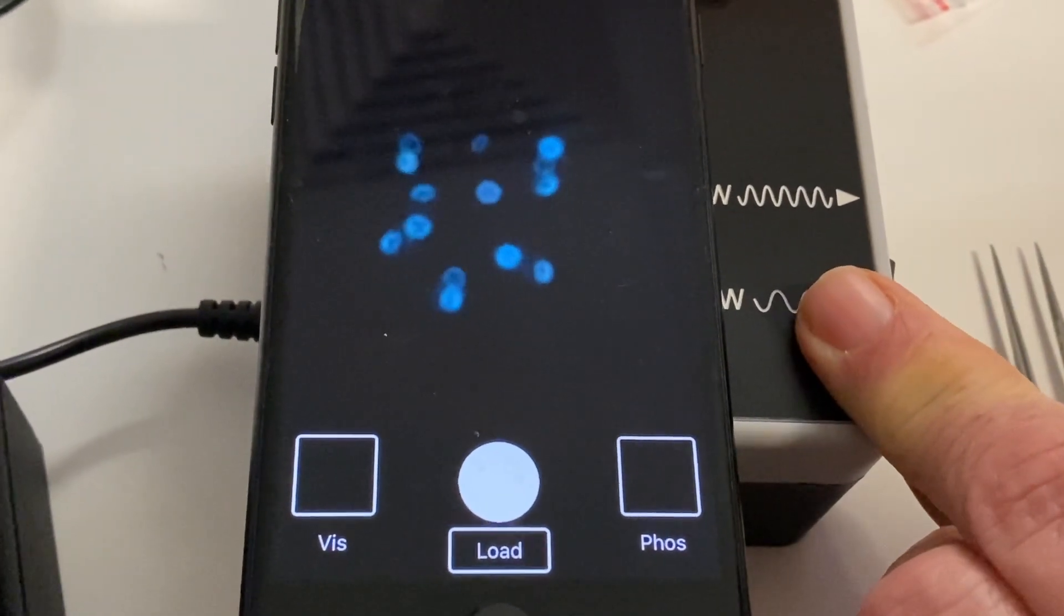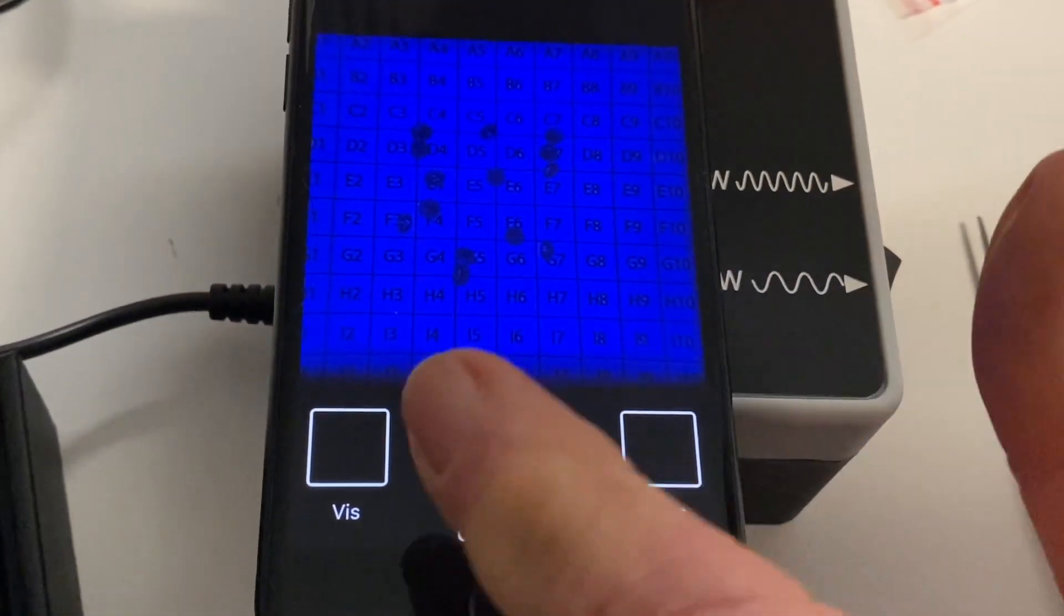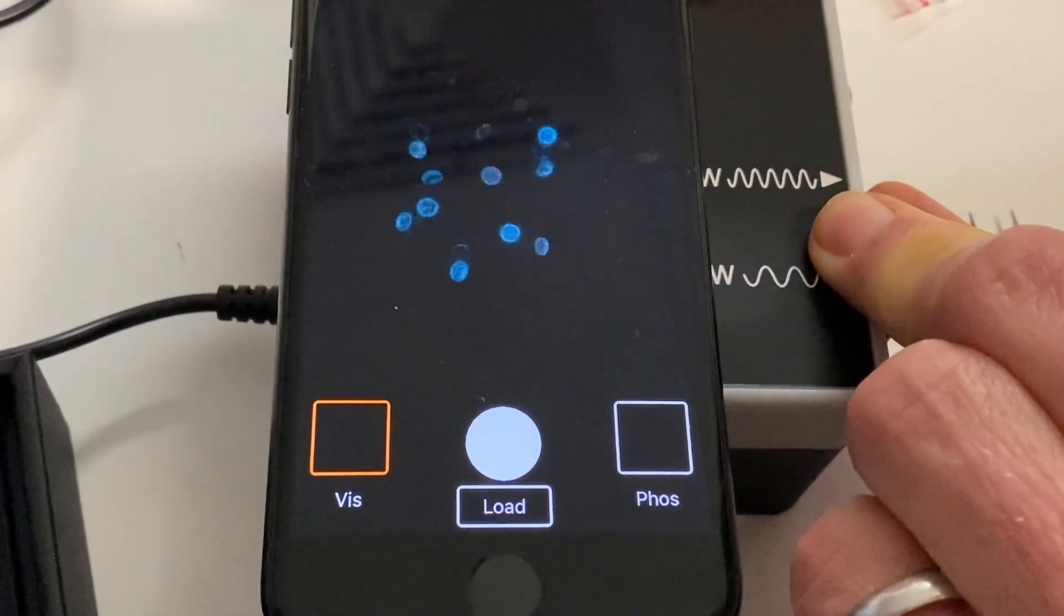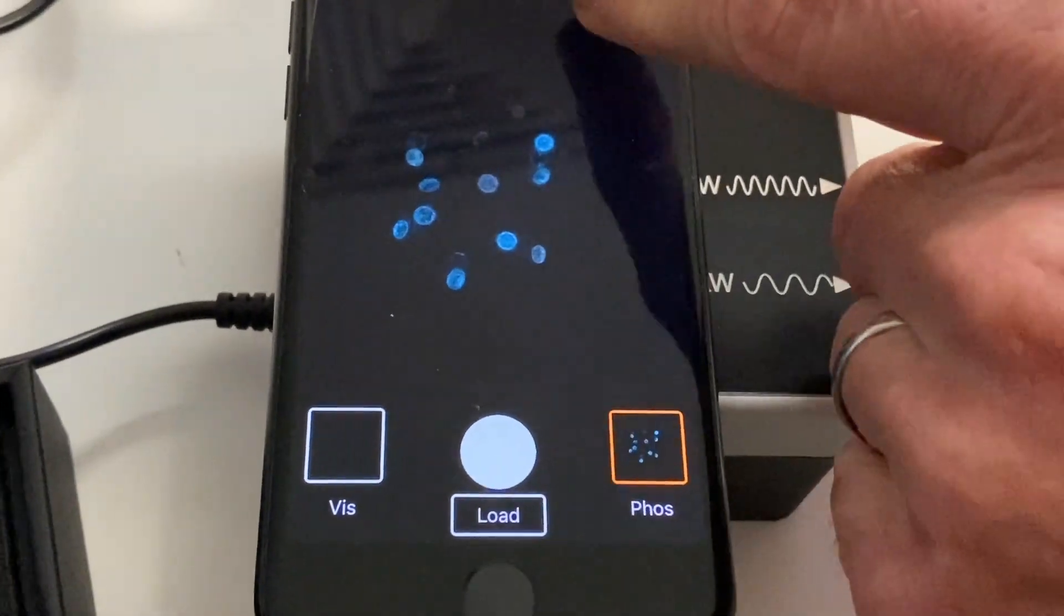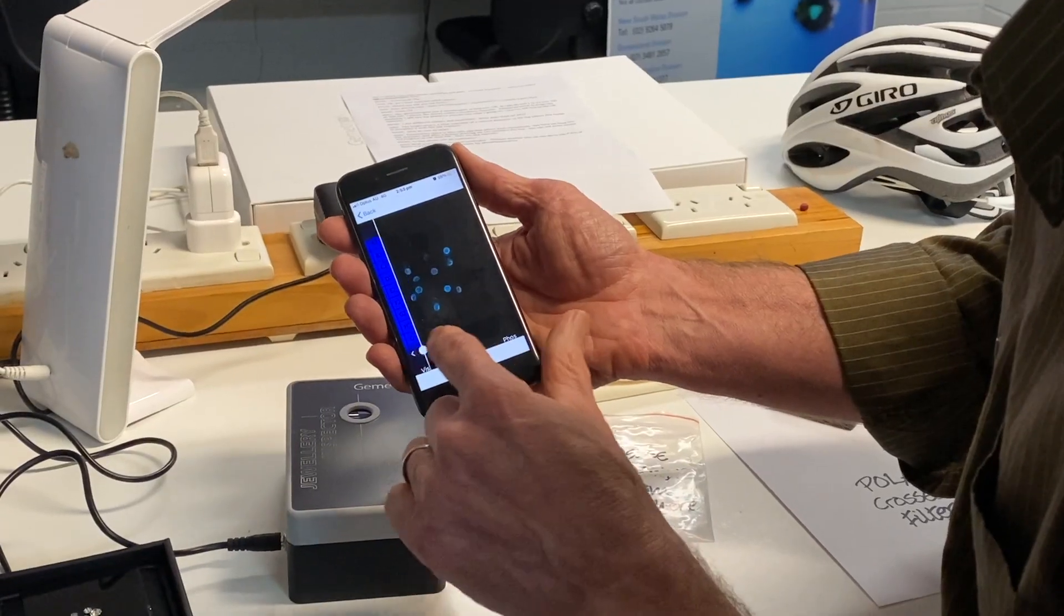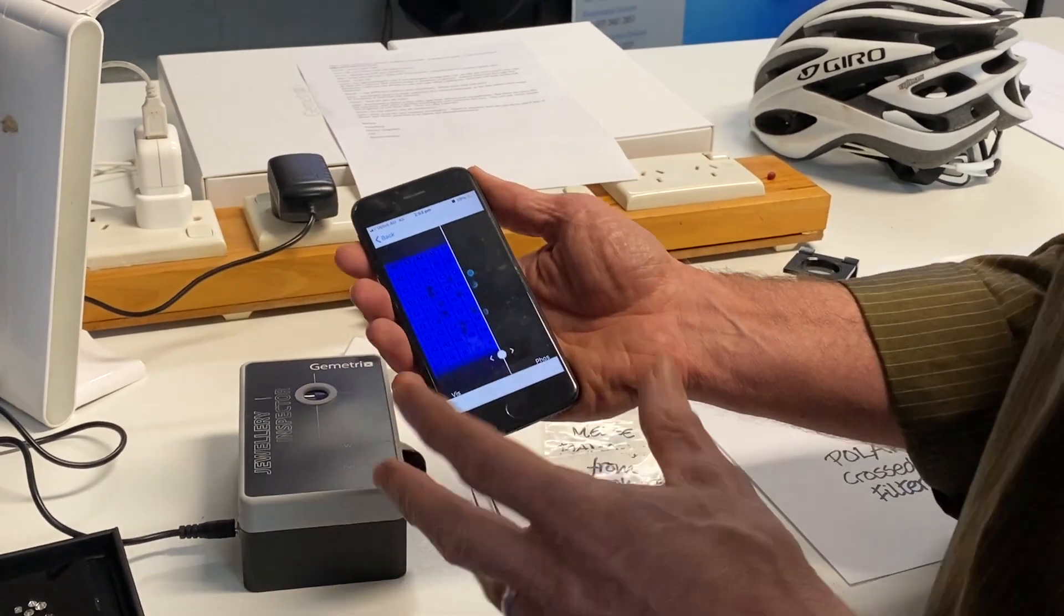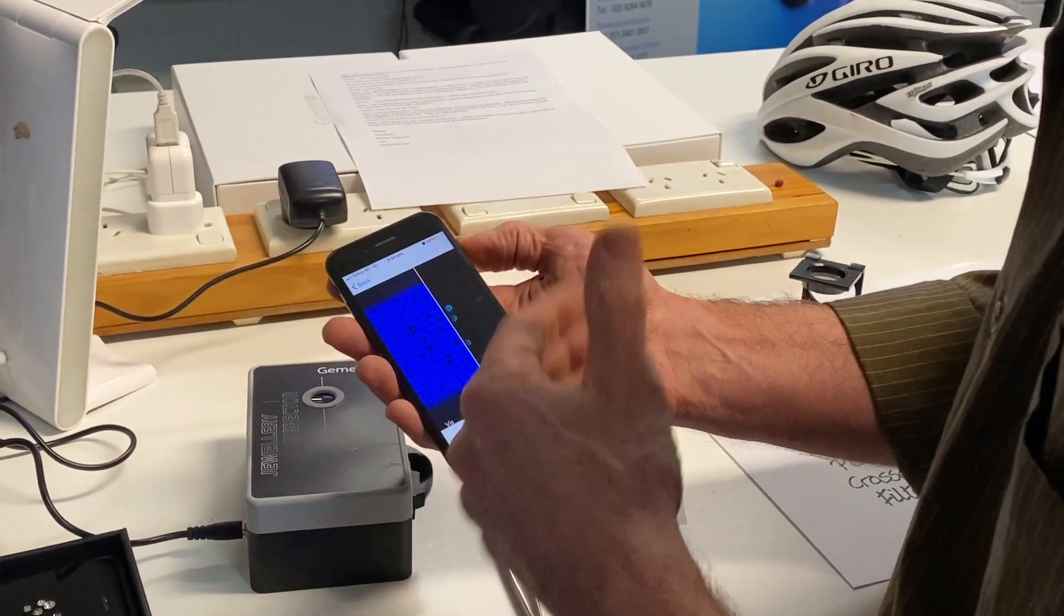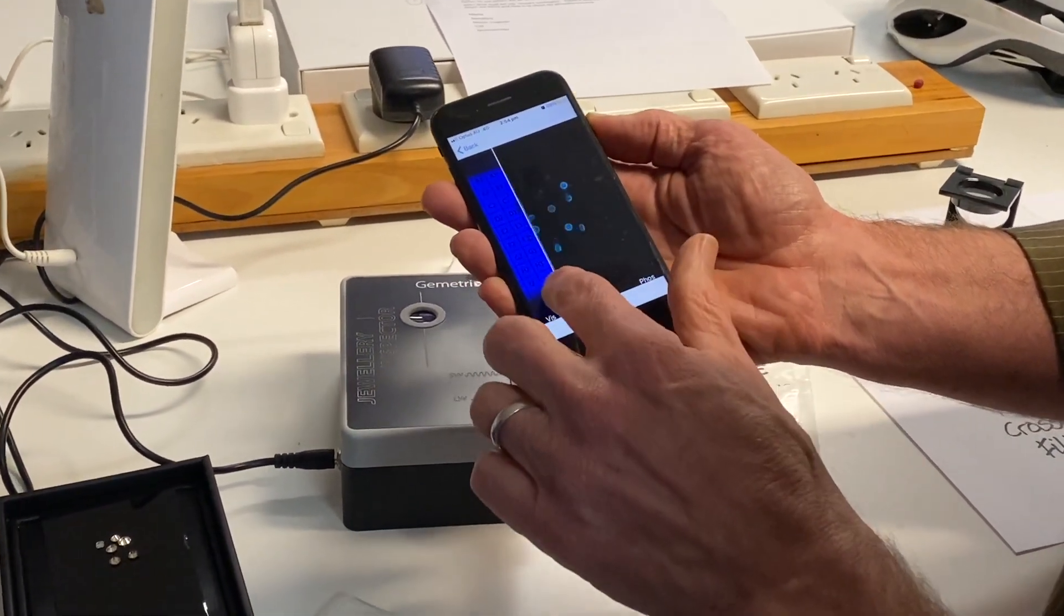If we go back to what we had before. And you can see all of them there. I could record the pictures and compare them, but it's... Oh, yeah, it is glowing. We can do the same comparison as before. And generally speaking, if someone's going to have synthetic diamonds in a parcel, there will be unlikely to be one or two stones, but either a large proportion. In this instance, they were all HPHT grown.